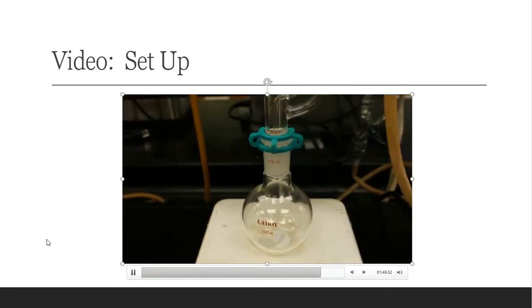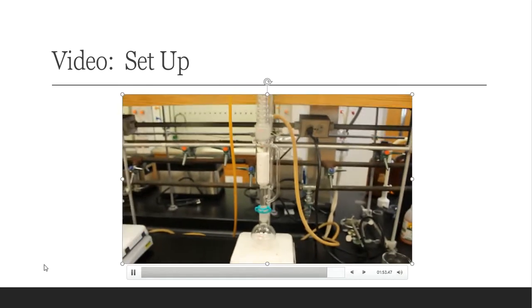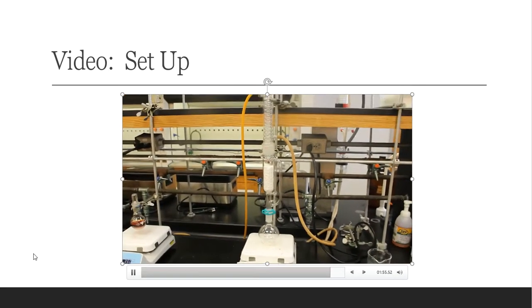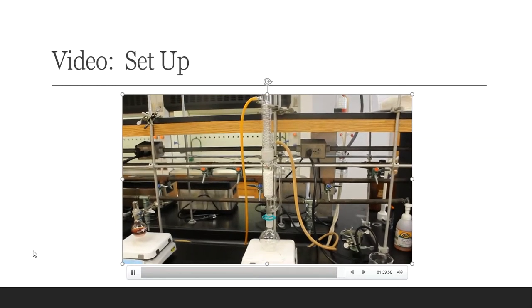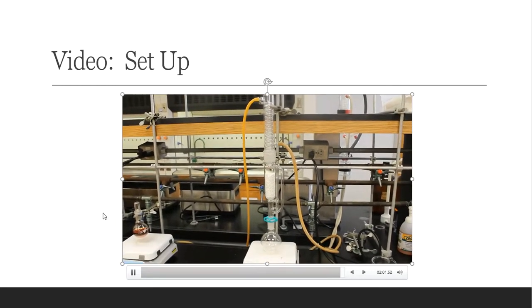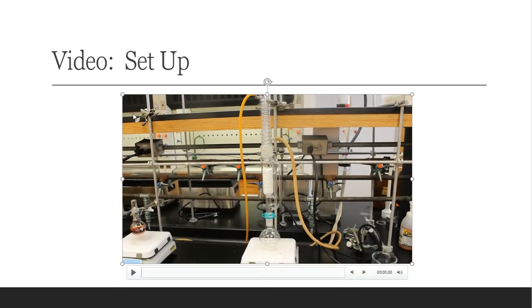All right, so as a whole, this is what the Soxhlet extraction looks like. Very simple design, not too many pieces and parts that go into it, but folks, there you go. There's the Soxhlet put together as a whole. Okay, so there you go. You know what to write in your lab book at this point.